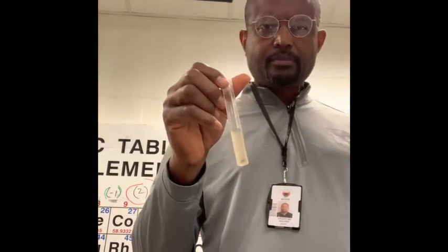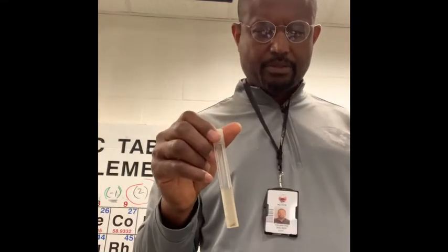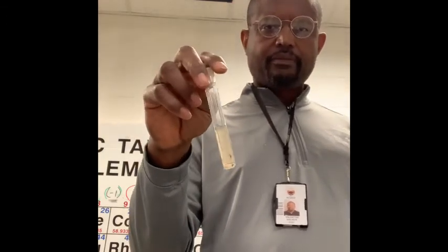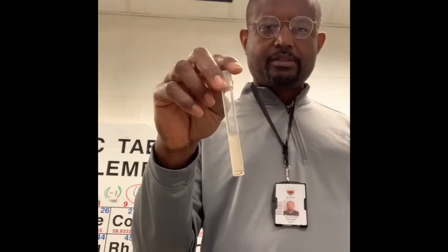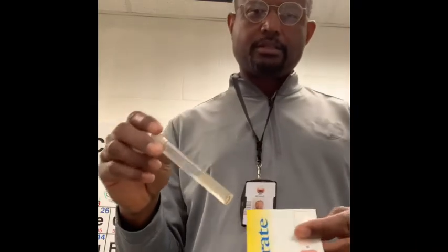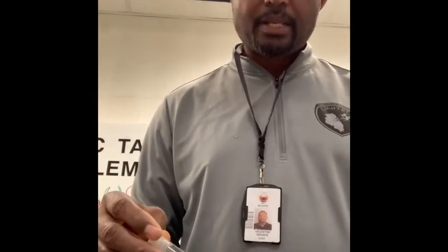Okay, so we're back to check on our test. Basically, now we're going to match the color of our nitrate test solution to the color on our card. And it comes out to about 5 milligrams per liter of nitrates in our water. So it matches there to about 5.